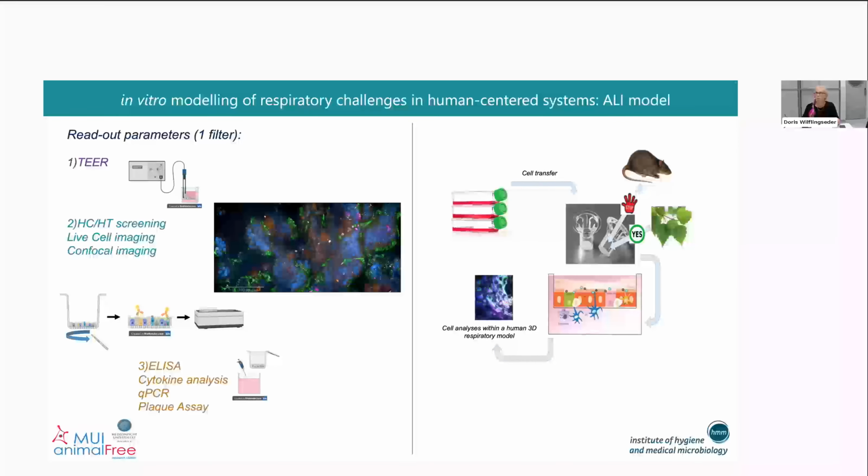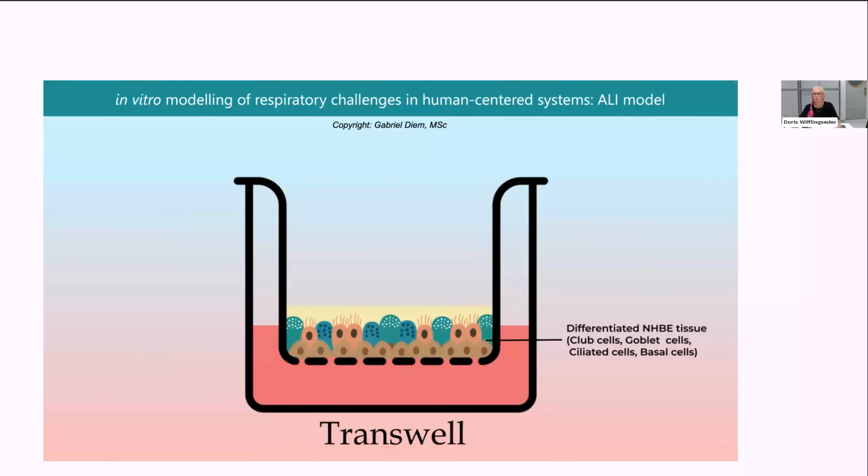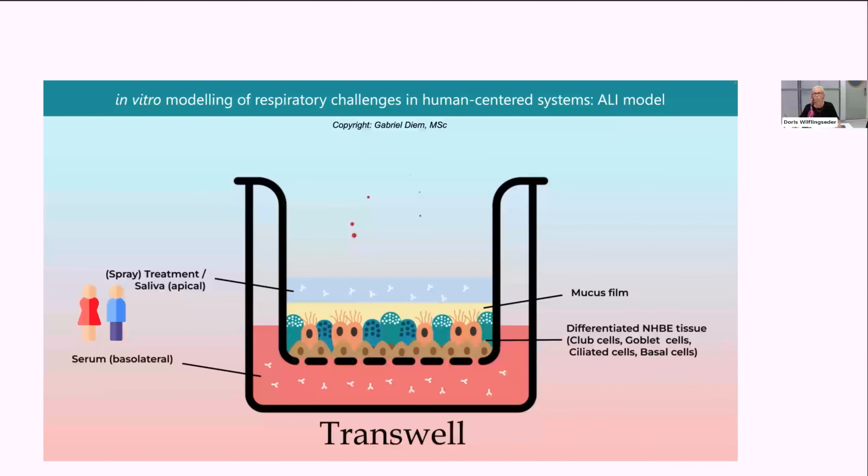But of course, such a system is not really appropriate for high content screening of lots of drugs or possible antiviral sprays. But this system nevertheless can be used for testing in a patient-specific manner, because when we have this fully differentiated system, which takes about 3 weeks to establish, we can treat these air-liquid interface models with saliva or serum from patients, which, as I said in the beginning, we get from the clinics.